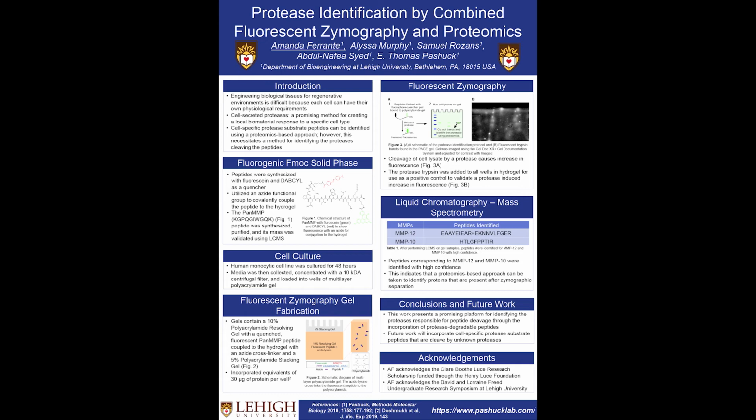After this validation step, I excised the fluorescent bands to do proteomics through liquid chromatography mass spectrometry. I found MMP peptides suggesting that MMP12 and MMP10 are present inside of the bands, confirming this proteolytic activity with a high confidence. This indicates that a proteomics-based approach can be taken to identify proteins that are present after a zymographic separation. In conclusion, I developed a workflow using a model system by which we can tether a peptide to a PAGE hydrogel, separate out a complex protein mixture through zymography, identify the location of the protease responsible for this cleavage, and finally characterize these proteins through liquid chromatography mass spectrometry.